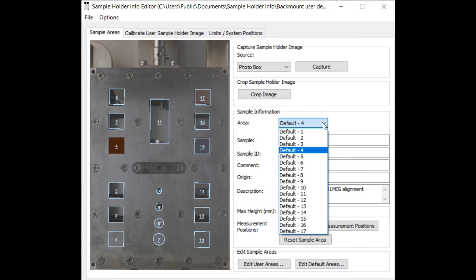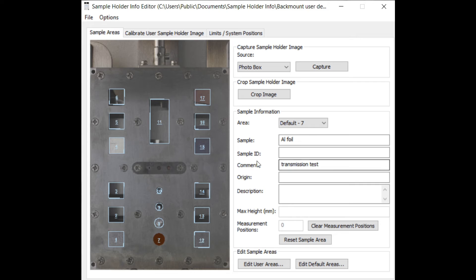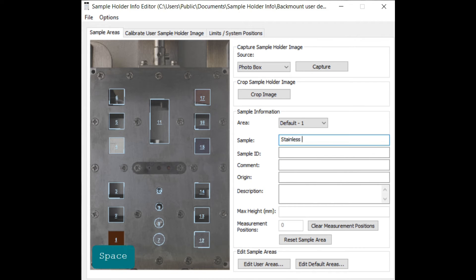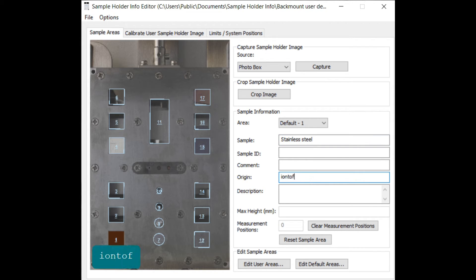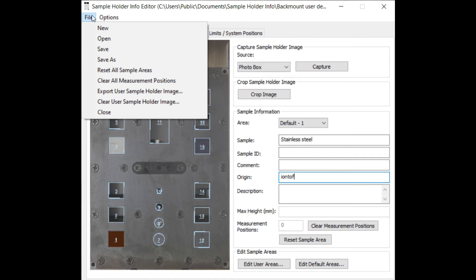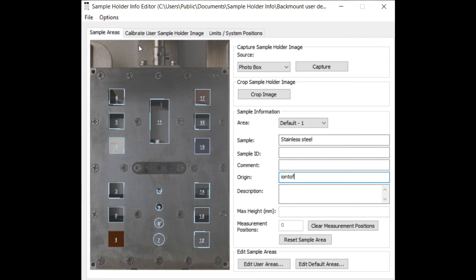For each sample area you can now enter the respective sample information which will be later automatically transferred into the header of each data file. To select the area use either the drop down box or simply click in the sample holder image onto the respective area. Do not forget to save the sample holder info file after you are finished and close the dialog.